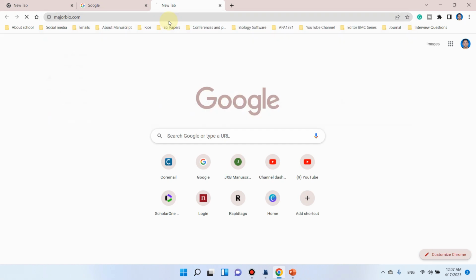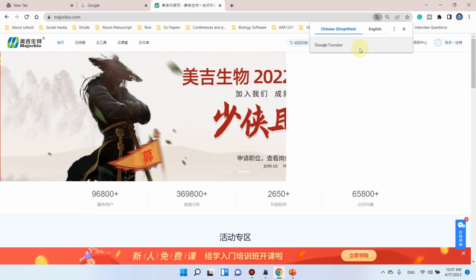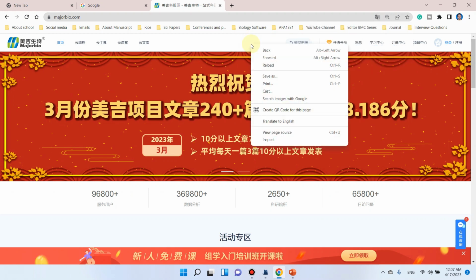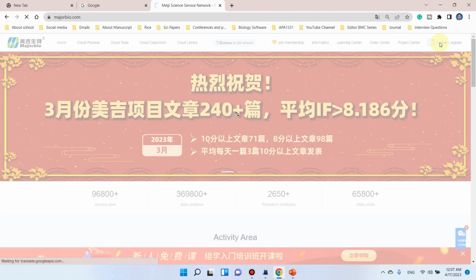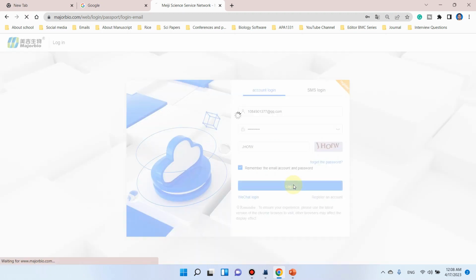My website is majorbio.com. My website is in Chinese. So if your website is also in Chinese, you can go here and translate it into the English version. If this fails, you can simply go here and click on this translate to English as well. You can see now the website is translated to English, and you can log in with your own login and password. Here you can see my login and password is already saved. You can use your own. So you can click on this login.